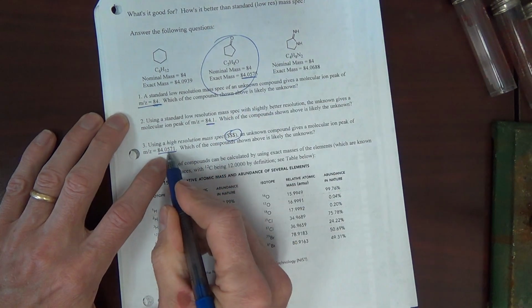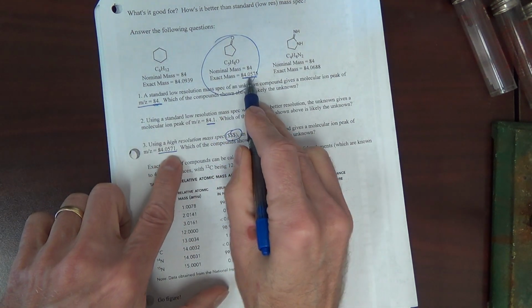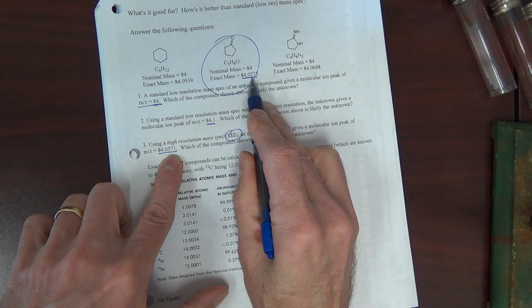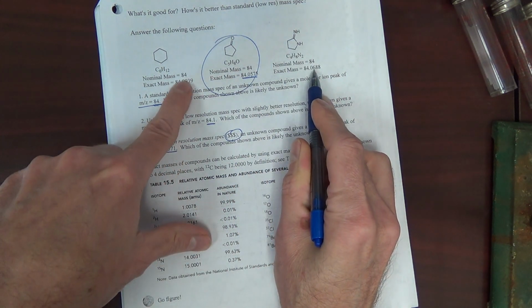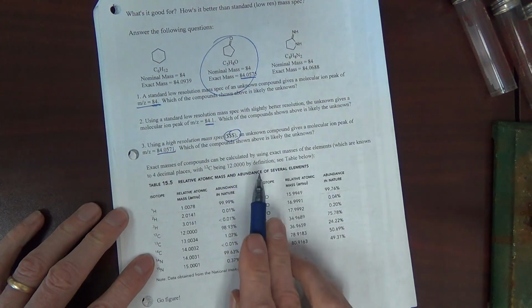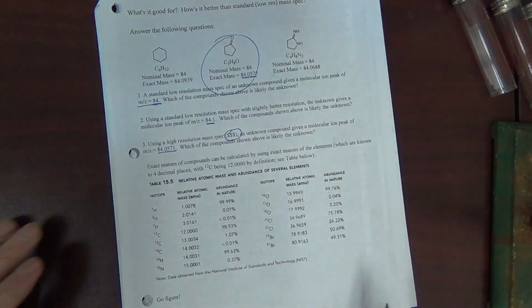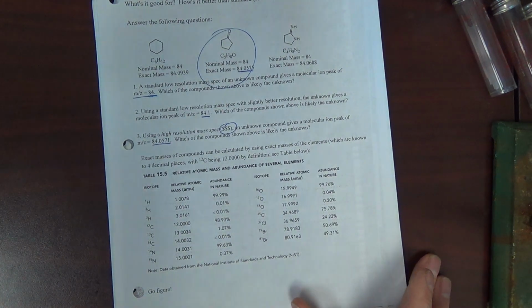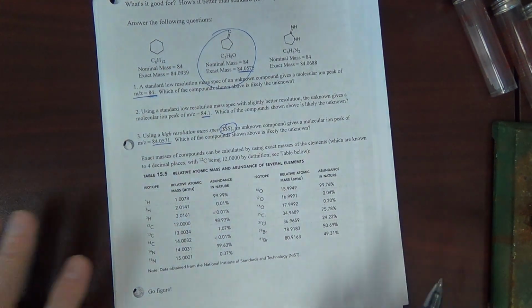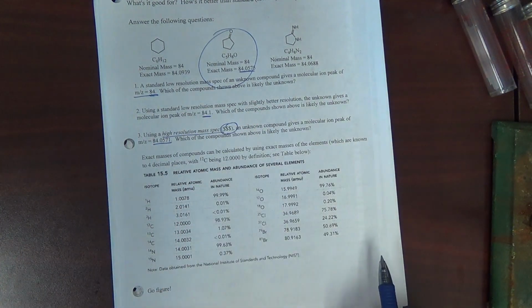Because now we're taking this out to 4 decimal places, and if you take this mass out to 4 decimal places, you see we have similarity here. Much closer here than it is to the other two. So only by high resolution mass spec can we distinguish these three, really. Now, of course, these three could be distinguished by IR or other means. But in terms of mass spec, they can only be distinguished if you use a high resolution mass spec.